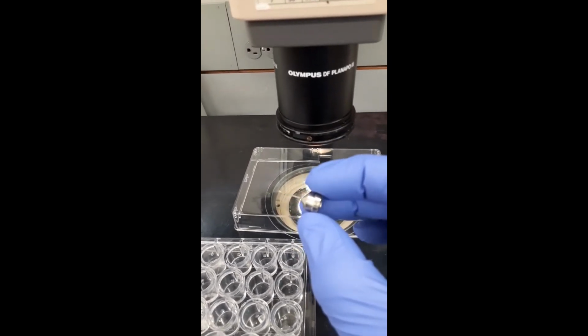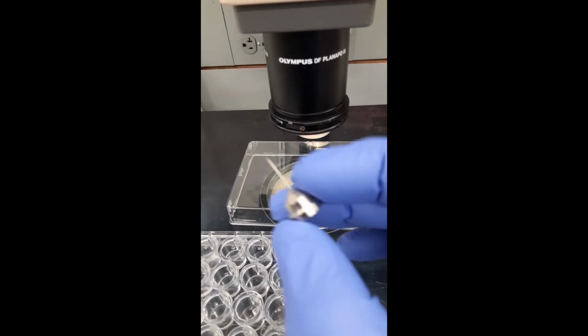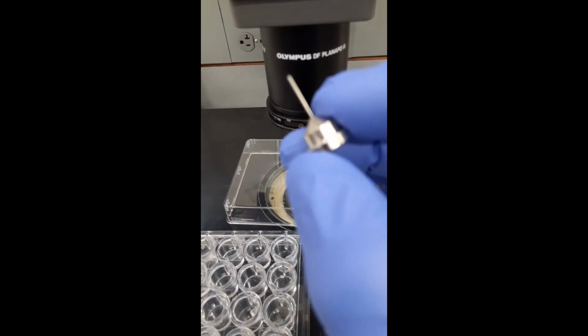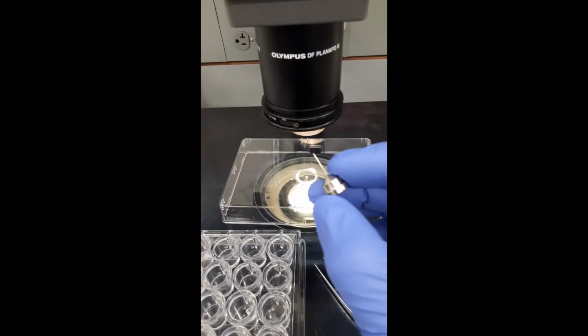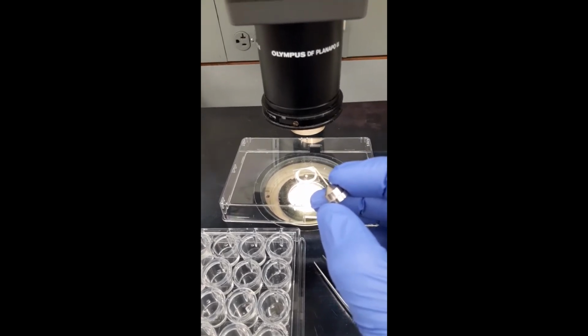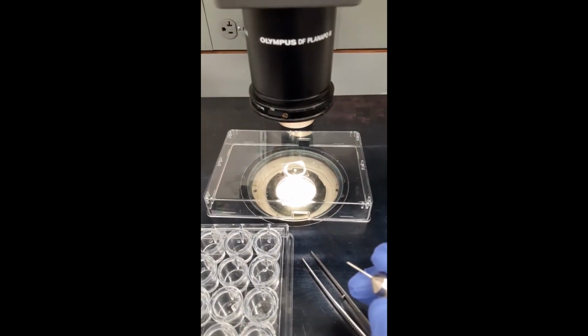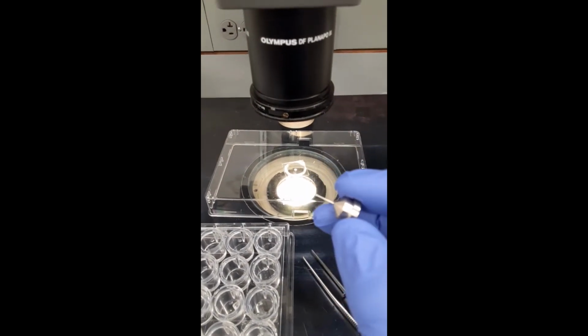Basically these sample loops have a magnetic base that fits onto the goniometer on the machine, and on the tip of the metal shaft is a small nylon loop that allows you to pick up the crystal. I have several because you need a variety of sizes because you want to match the loop size to that of the crystal.